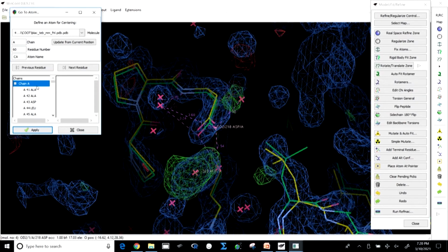If you remember, I always talked about a thing that the initial residues of the protein are generally not an integrated part of the structure. So that is why they are loose and they do not provide good diffraction.